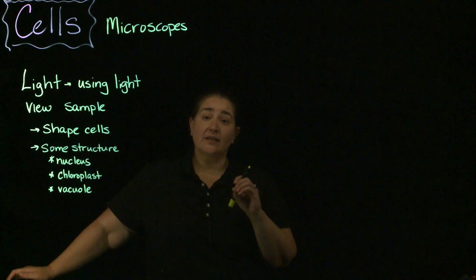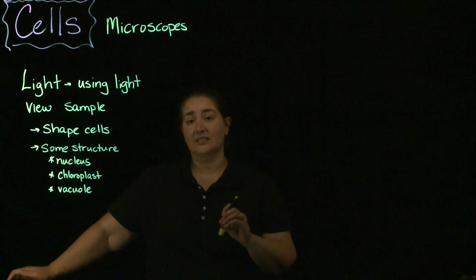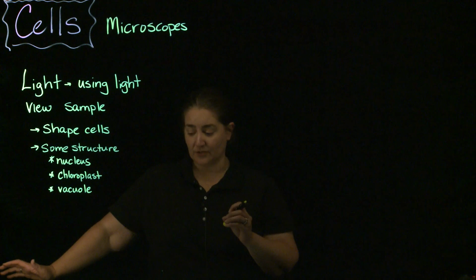With bacteria, again, you're going to be able to see the bacteria, but you're not going to see a lot of detail associated with the bacterial cell. Okay?